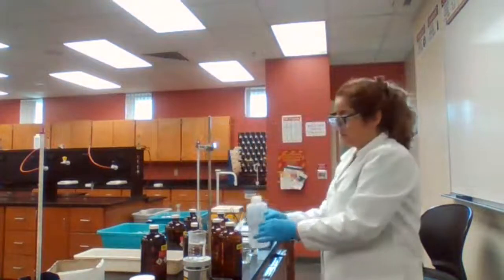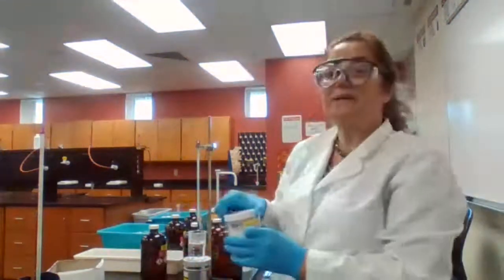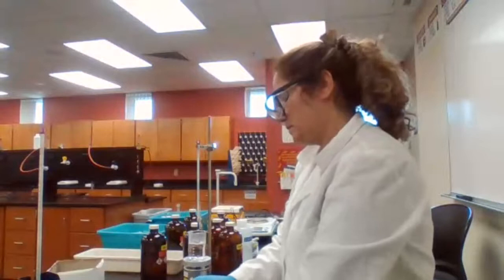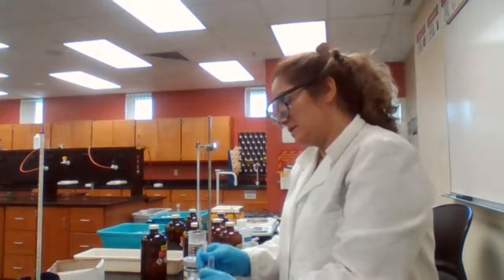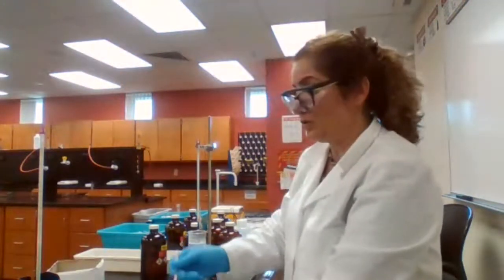I have water and naphthalene. What do you expect? Should naphthalene dissolve in water or not? You can ask a question before you answer. No, naphthalene is not alcohol. Naphthalene is an organic molecule. It's made of carbon and hydrogen only.